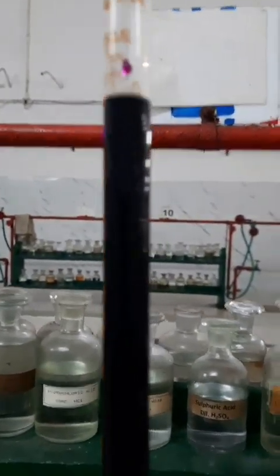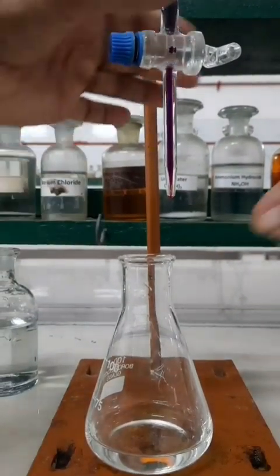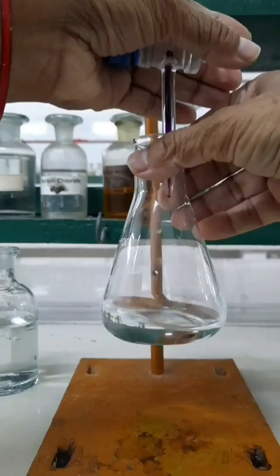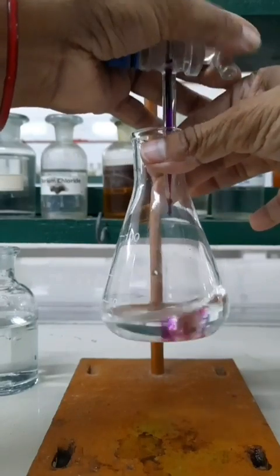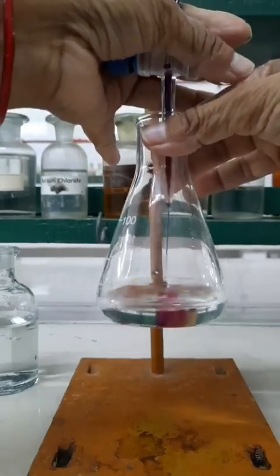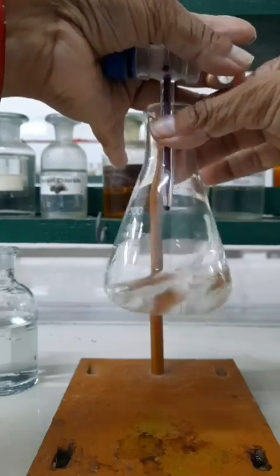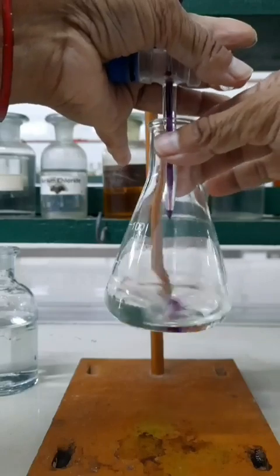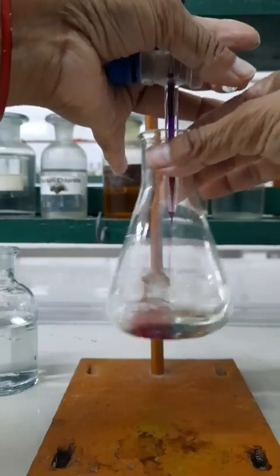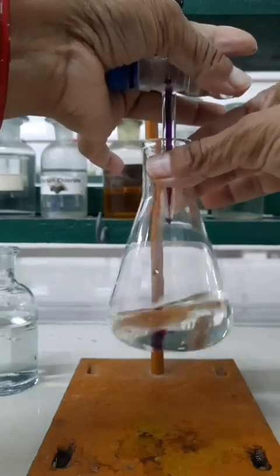Now be assured that the initial reading is 0 ml indicated on the burette. Then you have to open the knob and start titrating the solution present in the conical flask. Add the potassium permanganate solution slowly with constant stirring. As you can see, the pink color appears and after stirring it disappears. This process will continue. You have to titrate it till the permanent pink color appears.